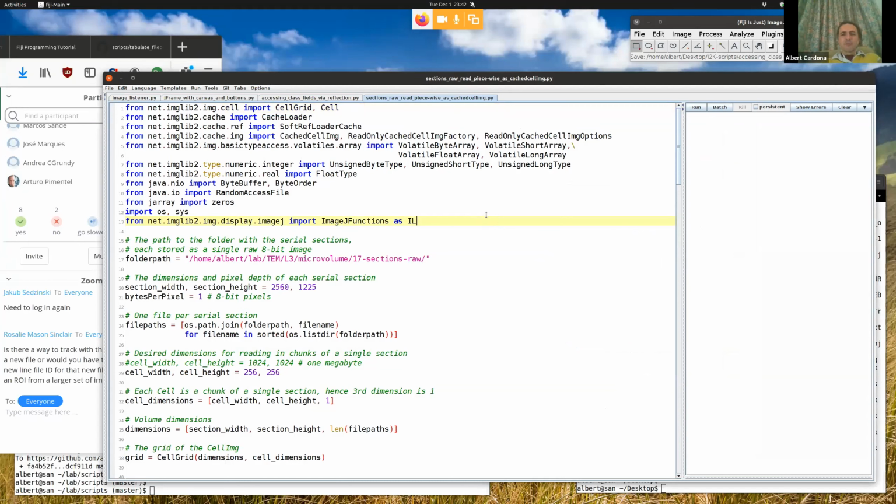Suppose you're using a focused ion beam scanning electron microscope, and it acquires images which are giganormous, of like, say, 10,000 or 15,000 pixels on the side. And you have several hundred of these pictures. As you acquire them, and they are huge, you want to keep track of them, you want to look at them. It's difficult to even load them.